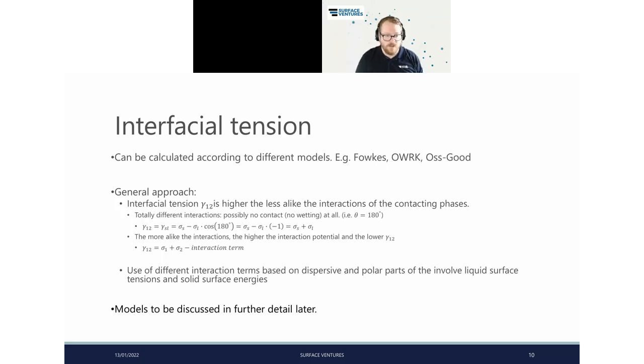And this is expressed in terms of contact angle, and can tell you about how attracted one phase is to the other phase. But you need to define your surfaces, what type of surface you're trying to measure, what type of liquid you're trying to use, and you certainly need to have a bit of an idea about that. But I'll talk a little bit about that later, as I said.